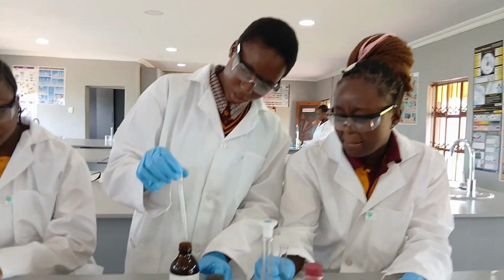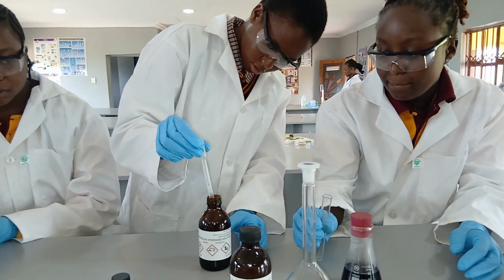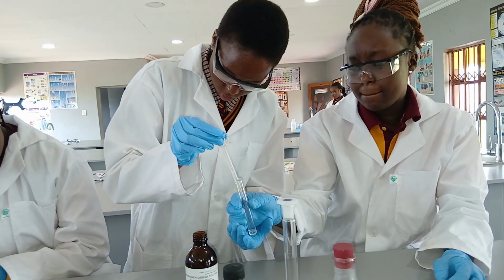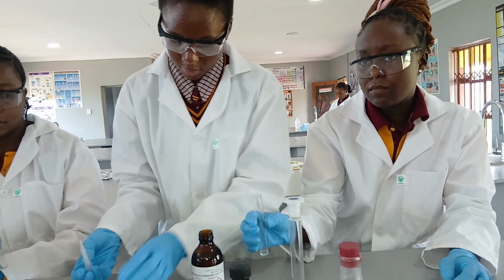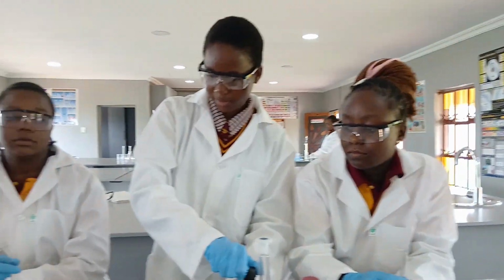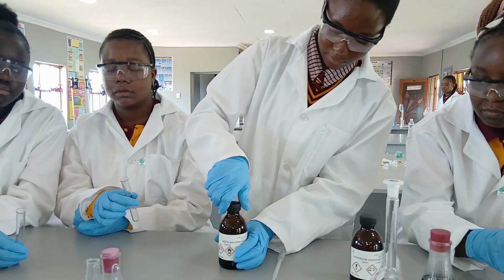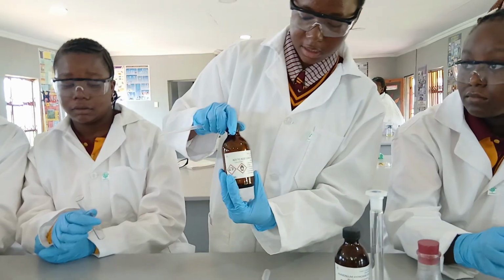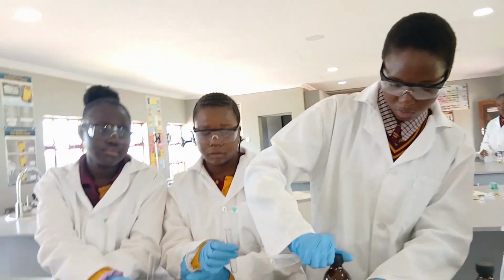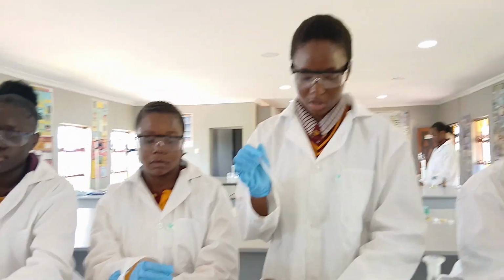So we're going to use our dropper to take a little bit of our solution and pour it into our test tube 1. Then we're going to use another dropper to take our acetic acid and pour it into our test tube 2 using our dropper. Take note that we are using another dropper.